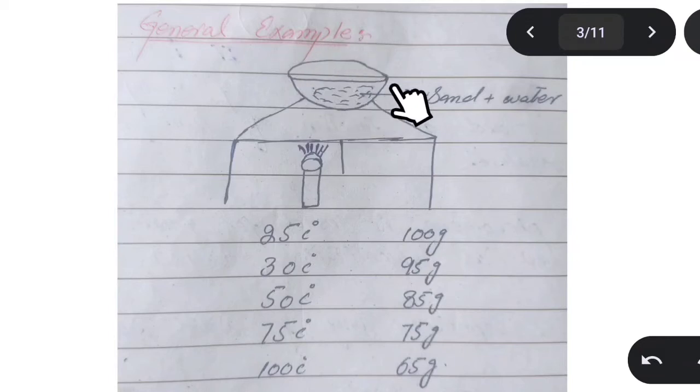Let's take an example. I took a china dish in which I put sand and water. The total mass of the sand and the water is 100 gram when the room temperature was 25 degrees centigrade. Now I took a tripod stand and a Bunsen burner. With the help of the Bunsen burner, I am going to increase the temperature of this mixture.